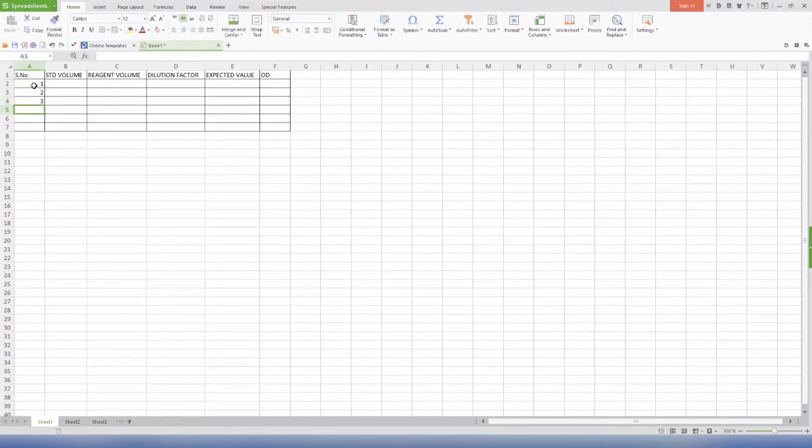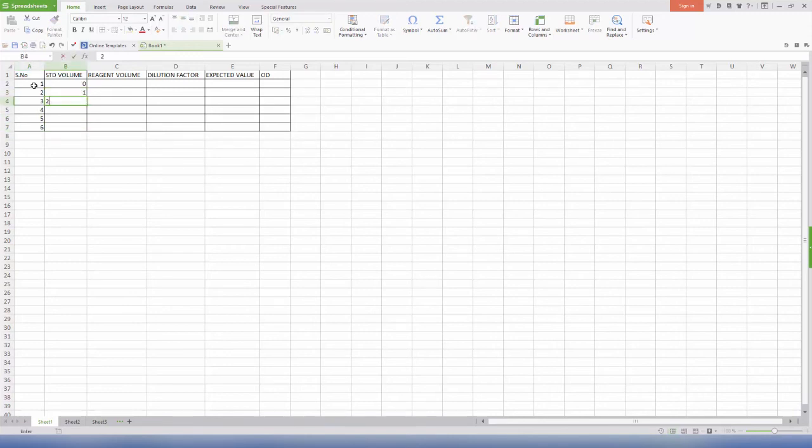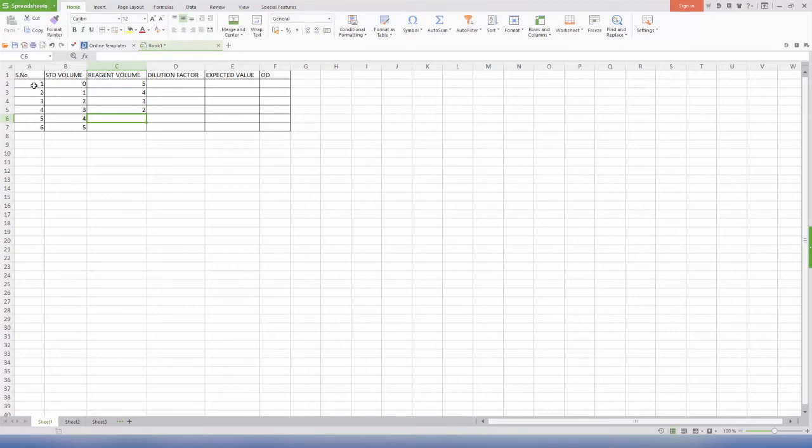Column A is serial number, B is standard volume, and C is Drapkin solution volume. Column F, OD, is manual.